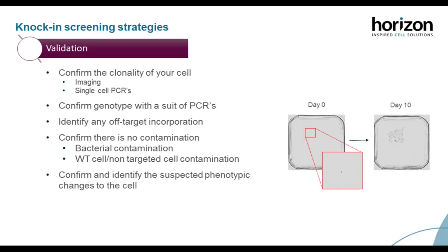So to confirm the phenotype of interest, we would recommend some Western blot validation. On the left, to confirm the gene knockout of the selection of knockout cells, we used a suite of antibodies to confirm the presence or absence of the protein of interest. The Western blot data confirms the absence of the protein in the knockout cell line, and this validates this gene engineering event. You can see that on the knockout of that gene of interest, you do not get that protein band.